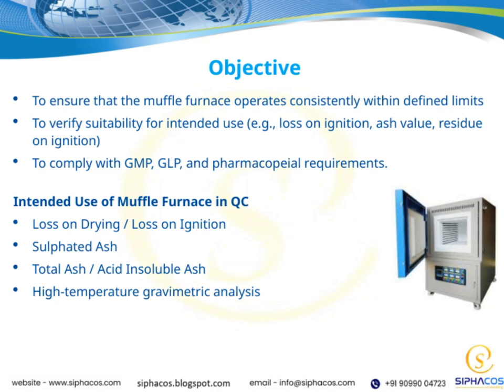Finally, it's important to remember that all these activities must be carried out in compliance with good manufacturing practices, or GMP, good laboratory practices, GLP, and the relevant pharmacopoeial requirements. These standards ensure that our procedures meet the highest quality and safety benchmarks.